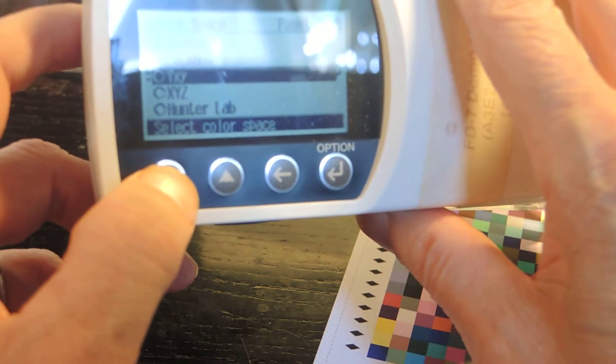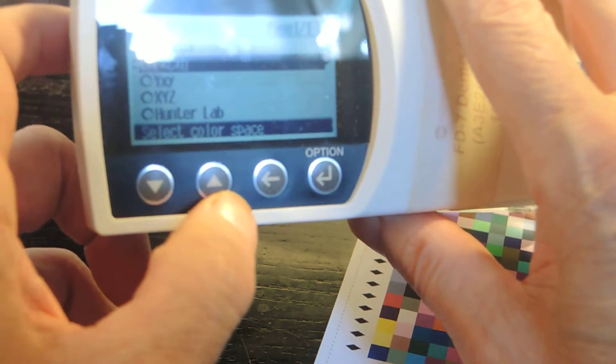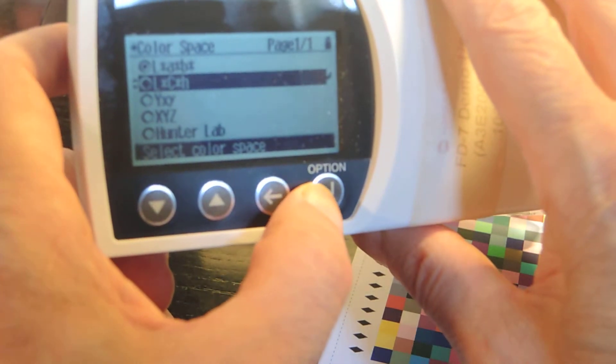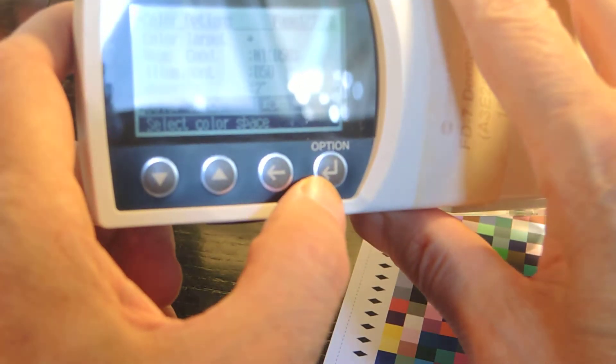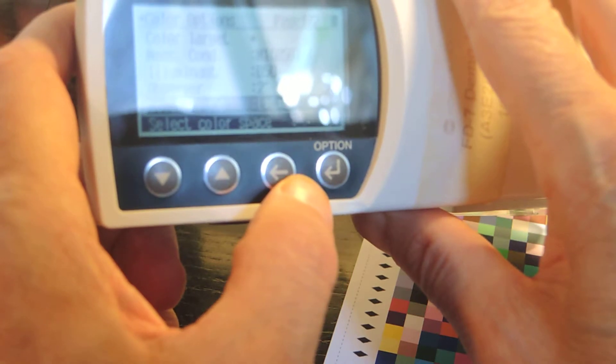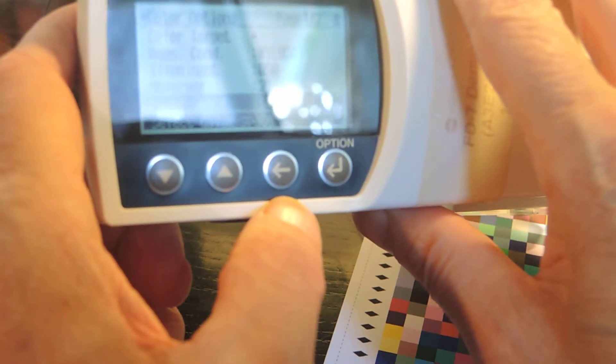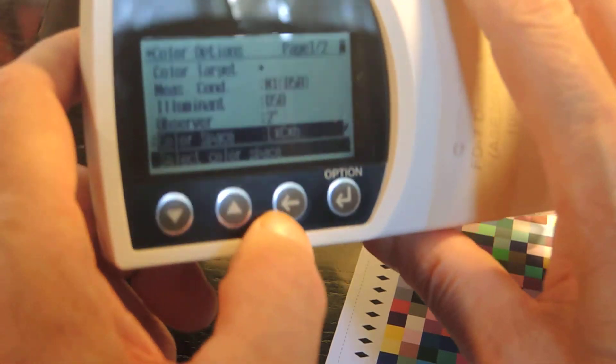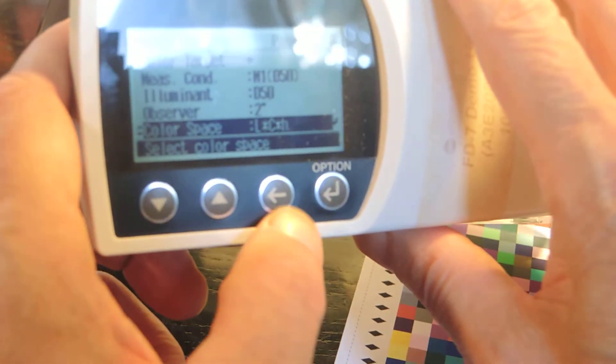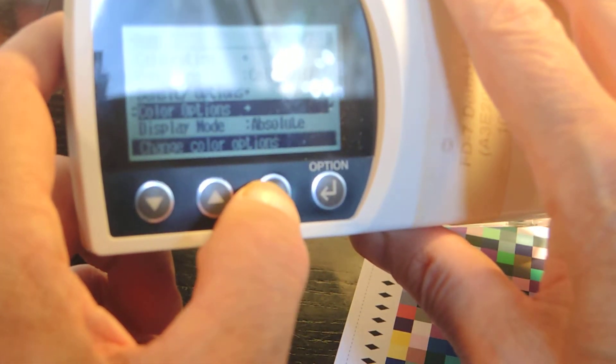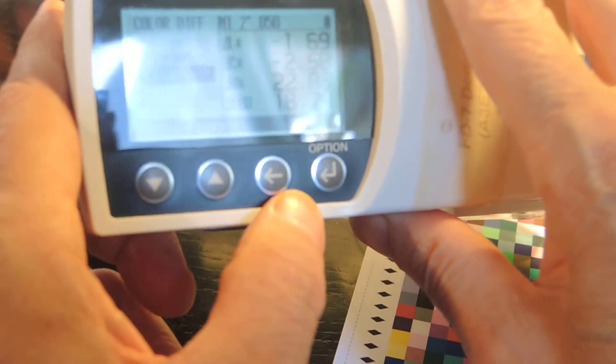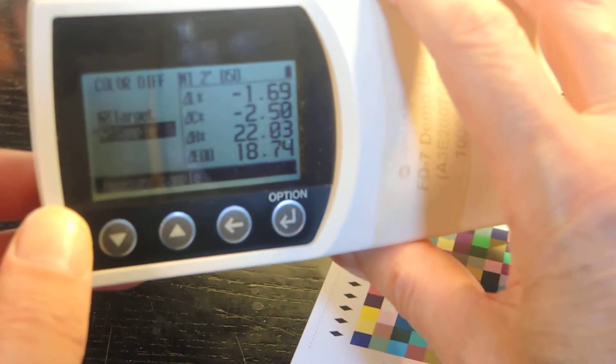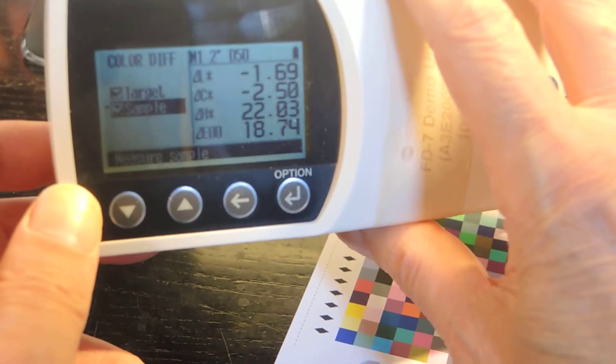So let's go back to LCH. Use that as an option. Press enter. And let's not talk about M1 or D50 or Illuminant. I'm probably going to lose myself in those menu for now. So let's go back up. One more, one more, one more. So now you see LCH. The difference is displayed in LCH.